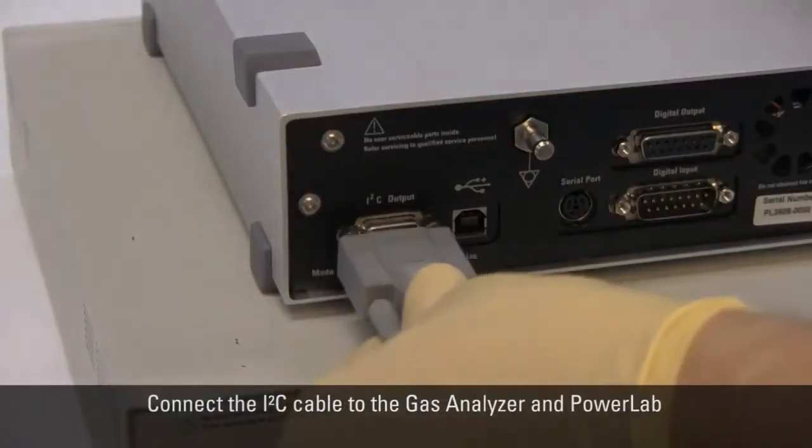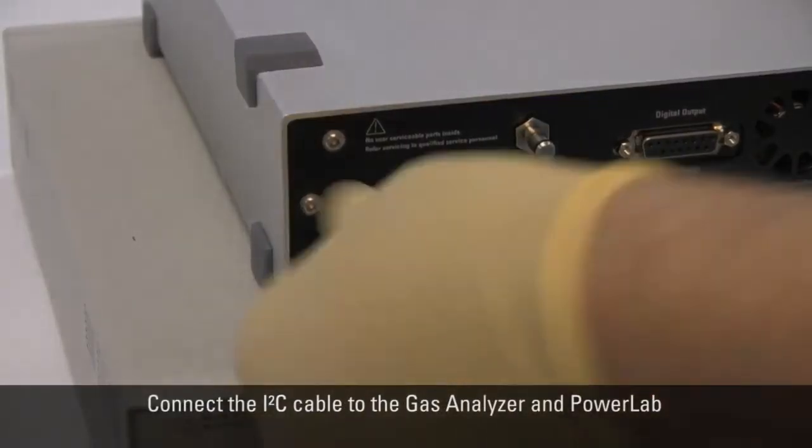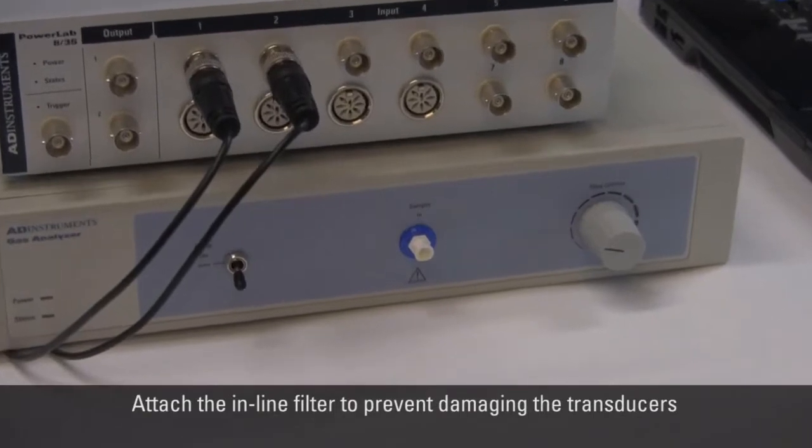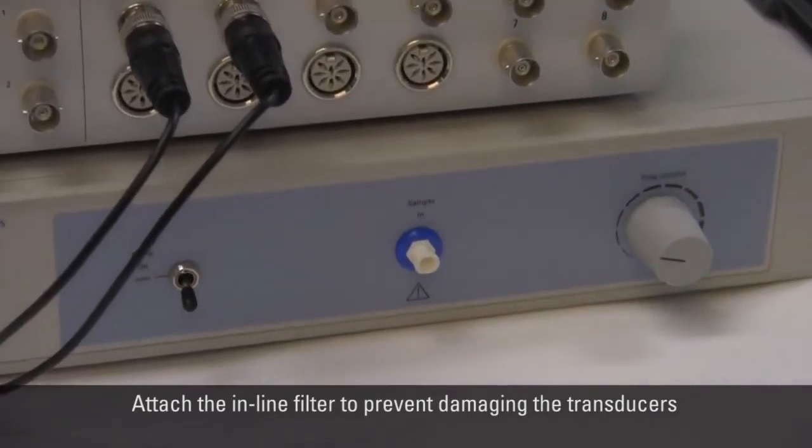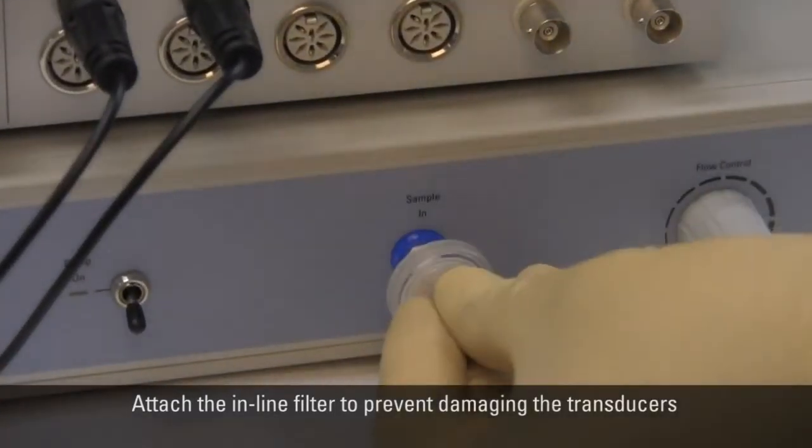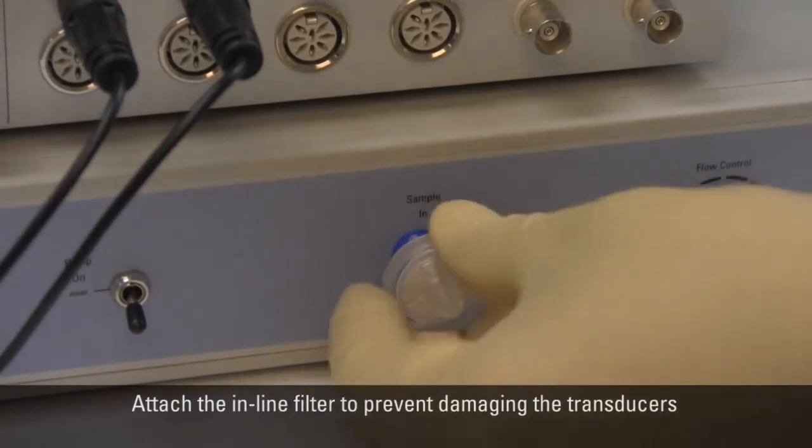Connect the I2C cable to the Gas Analyzer and PowerLab. Attach the inline filter to the sampling port of the Gas Analyzer to protect the transducers against moisture or damaging particulates.